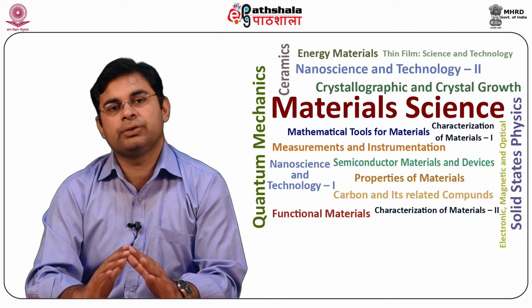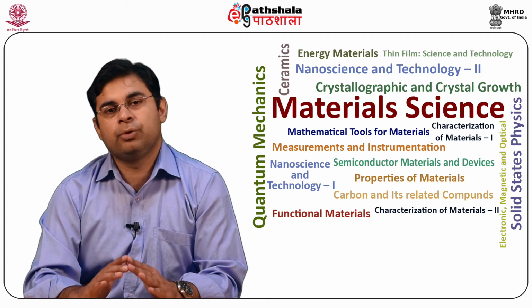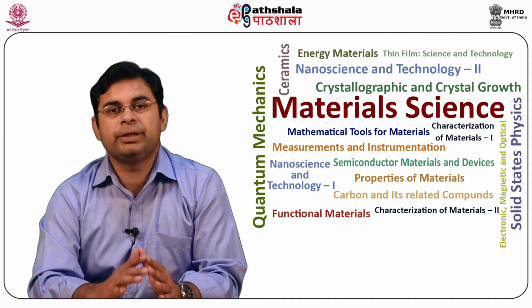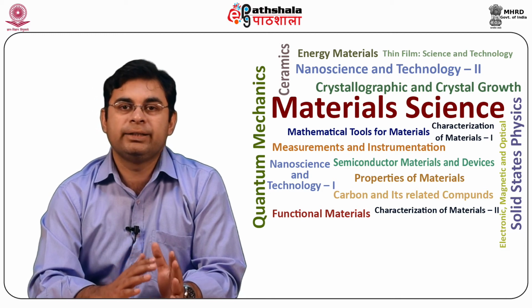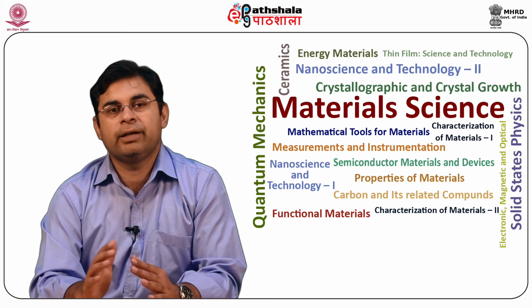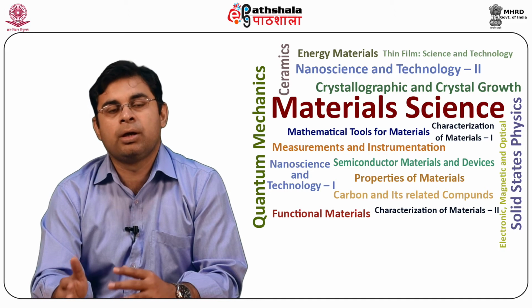The tip has a diameter of only a few atoms. The separation distance between the tip and the surface is close to 1 nanometer. At this small distance, a quantum mechanical tunneling current can flow between the atoms at the tip and the surface.